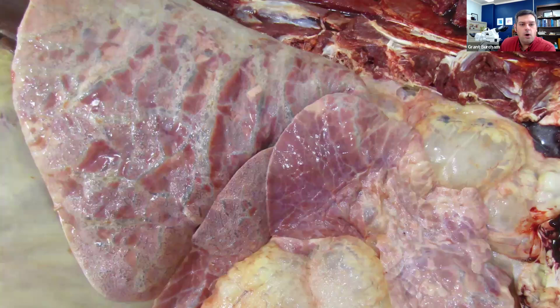And so this is the opened chest cavity of that heifer. So the head's to the right, tail's to the left, and these pink structures are lung lobes. And you might notice that there's areas where it's really pink, and there's areas where it's kind of white.